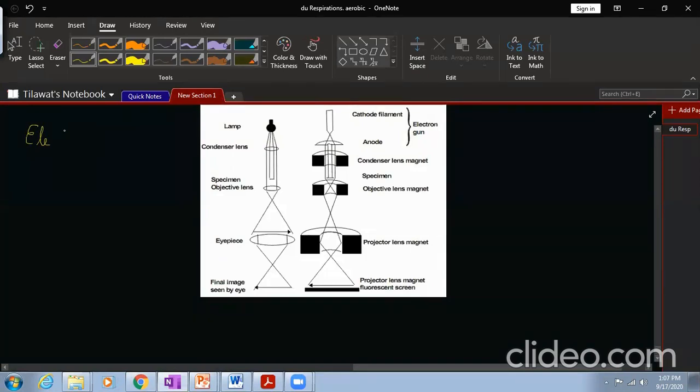The general formula was that you divide the wavelength of visible light by 2, and up to that limit you can study the specimen. For example, if you are using 500 nanometer visible light, you divide it by 2, which gives you 250 nanometer.